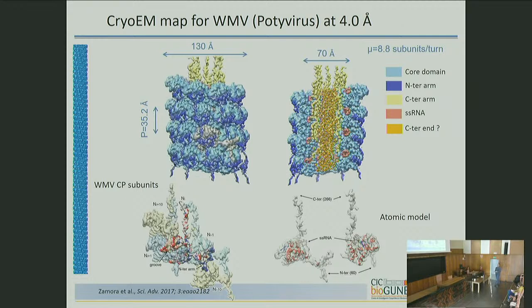What we obtain, the helical arrangement is almost identical. They have the similar arrangement. They are also a left-handed helix. And the novelty here is that the N-terminal region, that in the previous case was side-by-side interaction between subunits, here has a sharp turn and goes to make an interaction with the subunit that is in the next turn on the helix. So it's a dual role within the same turn and between turns.